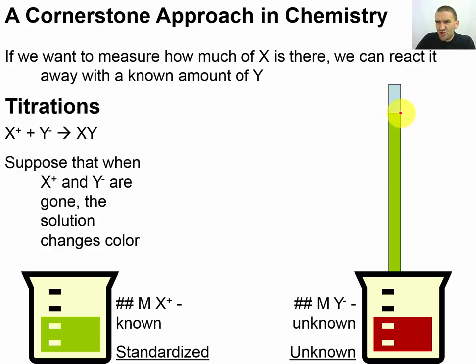Now we'll record our starting value, and it's probably not going to be the value 0, because we're going to bleed out any bubbles that are in the line and prepare our experiment. And we don't really need it to be 0. In fact, it's kind of hard to read it at 0 because, remember, when you read glassware, it's really helpful when you have those little markings above and below a line. At 0, you don't. So it's really hard to guide the eye and get a good reading with significant figures. Anyway, we'll have our initial volume.